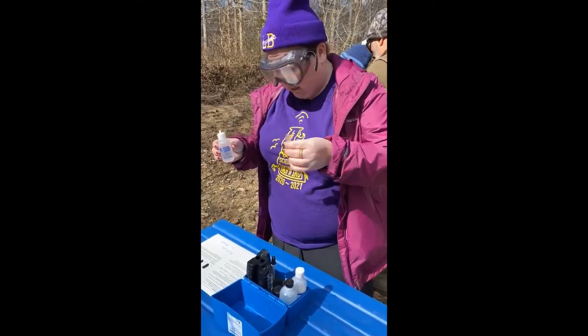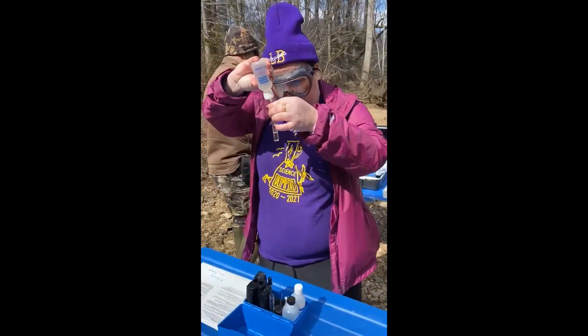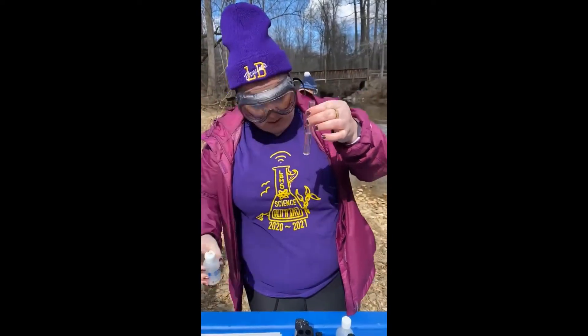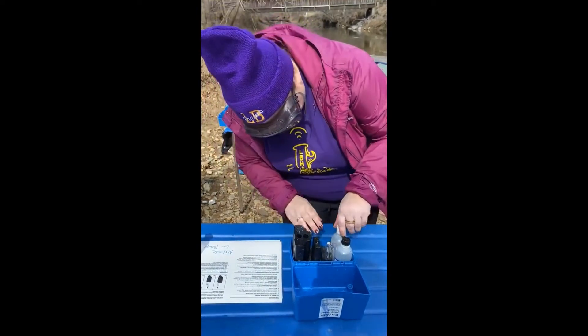We're going to run our nitrate test. I have my sample of water from our creek. Fill it up to the five milliliter mark. Then dilute to the second line with mixed acid reagent.